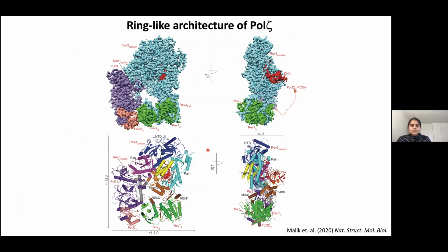So we feel that it could be lying on the grid. It basically was lying on the grid in this orientation, and we could not find side views at all initially. So we think that could be an explanation for it. I mean, you can explain air-water interface interactions as well, which usually is a problem for sample preparation when you do normal plunge freezing. But yeah, we can say that the flat shape of the molecule could have contributed to it.